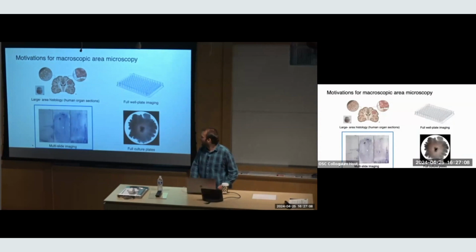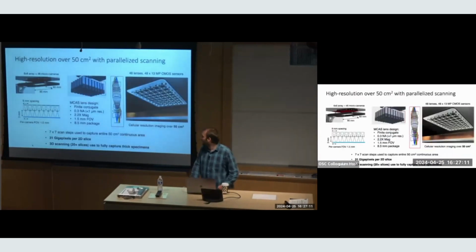setting with that lab. Okay, we also designed, just because I want to show the optics, we designed other lenses. So this is an array of 48 imagers, also at 9mm spacing. And we worked with a company to design 2 types of finite conjugate objective lenses, actually. One is a 0.3 NA, and one's a 0.5 NA compact microscope objective. And what's interesting, it is finite conjugate, right?